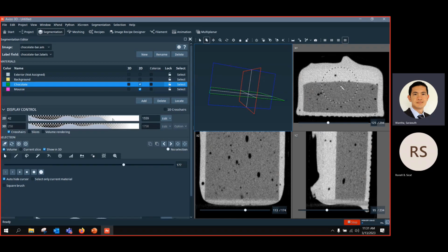So I use the big brush tool here. I stamp once on XY, and on YZ. And you can see that they also have the indicator where it appears in the different planes. So I stamp here on XY, and I come to XZ, so I can make another stamp here. And then on YZ here, I just stamp. And then you can see that I create kind of 3 materials in 3 planes overlapping.